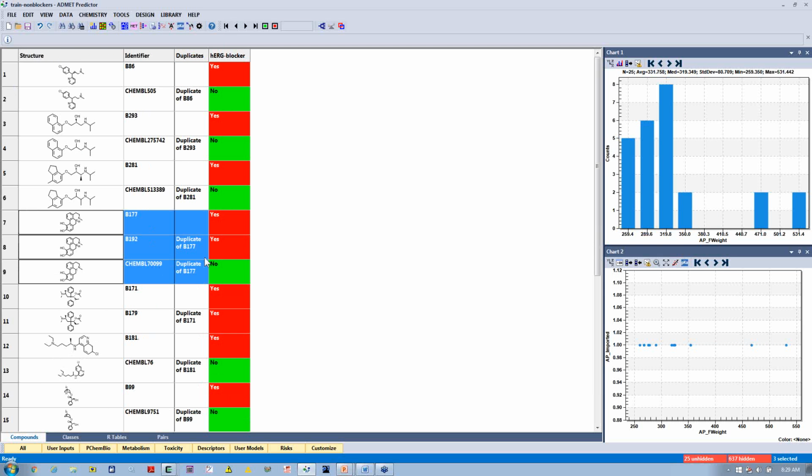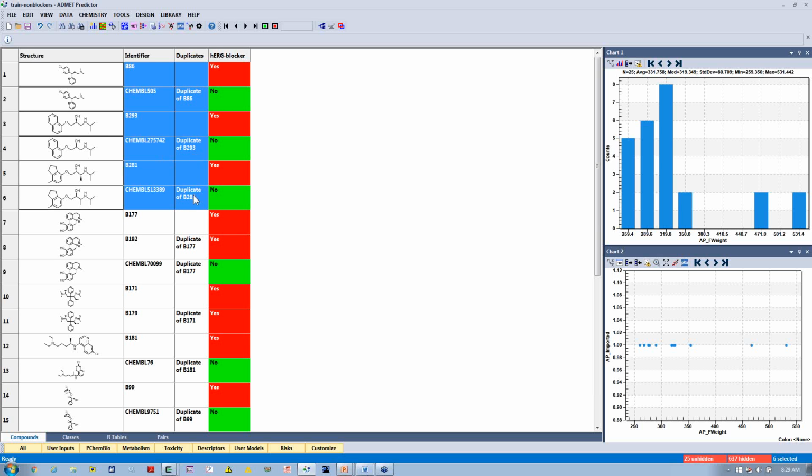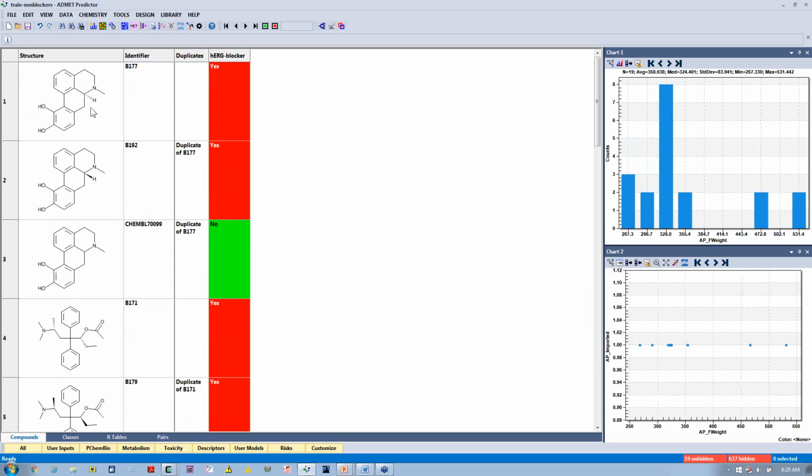Now if we look at this, here is a triplicate. So you've got duplicates under each other, so that's a triplicate, so we need to pay special attention to that. These first two we need to remove, and so on for the second set of pairs and the third set of pairs. So let's delete those, and then let's look in a little bit more detail at these.